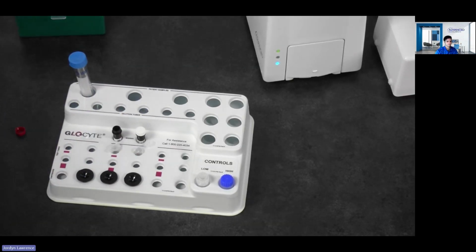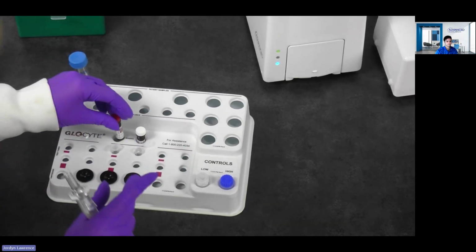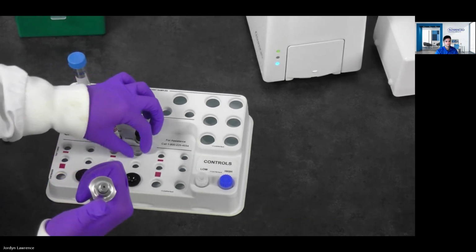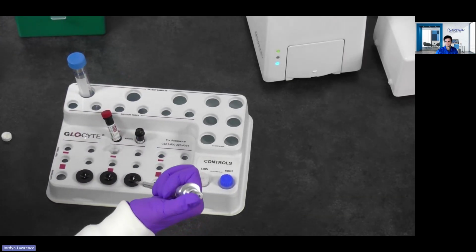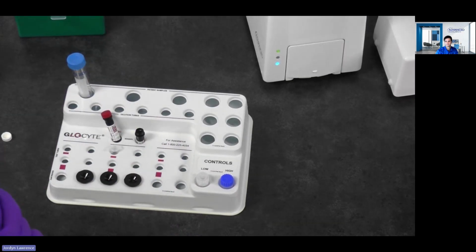But I can automatically go right into the white blood cell and pipette that right onto our test cartridge. I'll do the same thing. We're going to mix it 3 times. Get that onto our test cartridge. And this test cartridge is actually really cool. It has a membrane on the top. I will show you how that works.